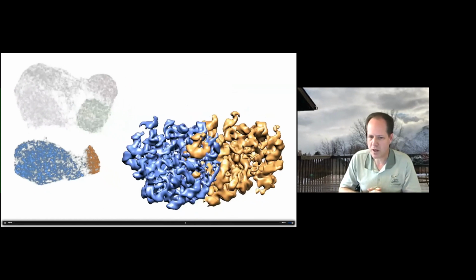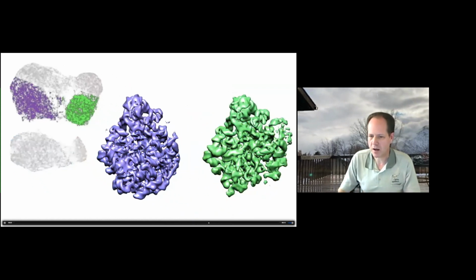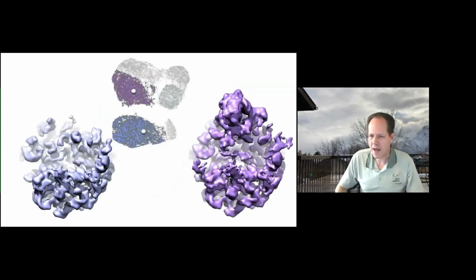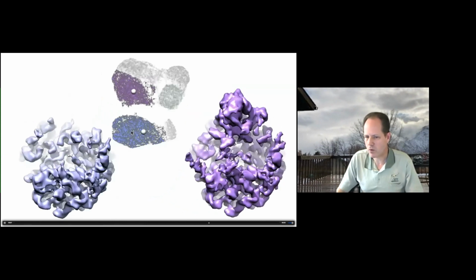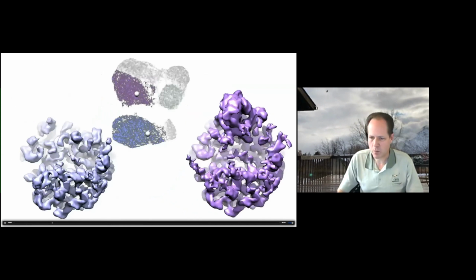There's one other thing we can show you here, which is what happens if we move continuously across the system. Let me just skip ahead to that. Here we go. So now what we're doing is we're generating reconstructions using only little local neighborhoods around each of these points that are moving across this space. So we're generating one over here, this one is over here, and this one is over here.